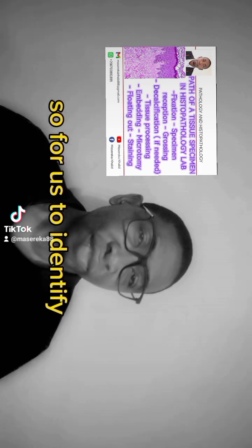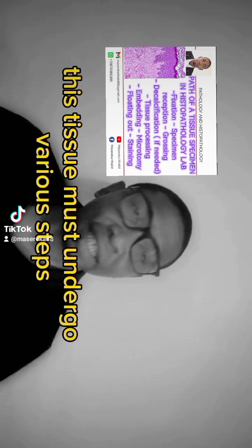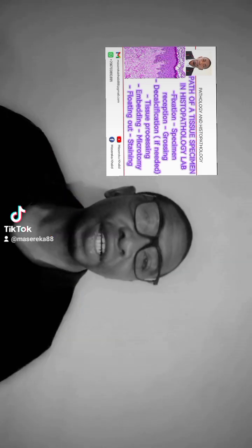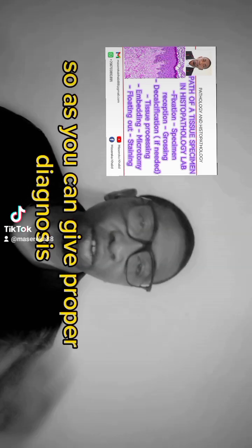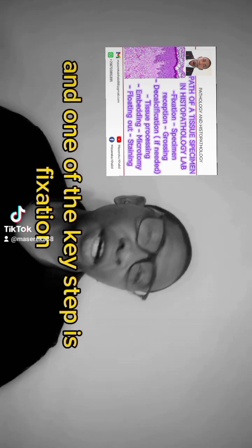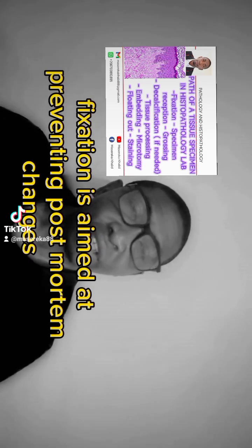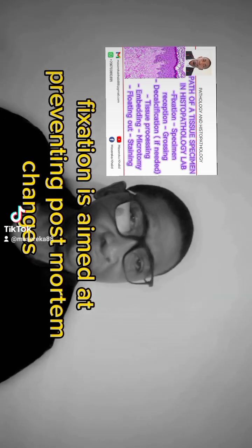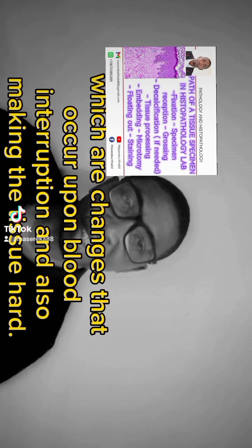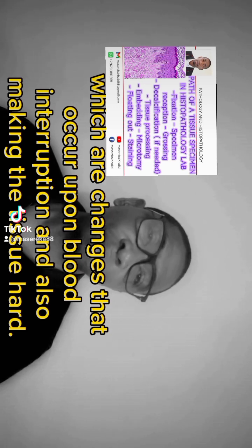So for us to identify cancer in a tissue, this tissue must undergo various steps so that we can give a proper diagnosis. And one of the key steps is fixation. Fixation is aimed at preventing post-mortem changes, which are changes that occur upon blood interruption.